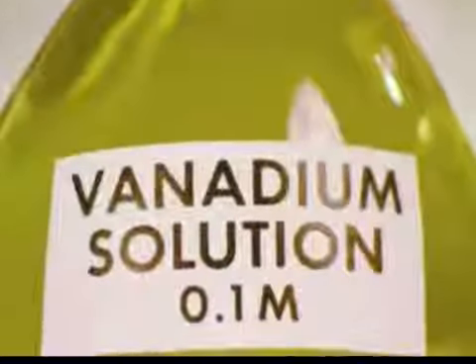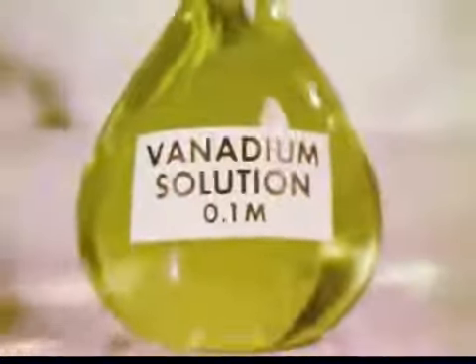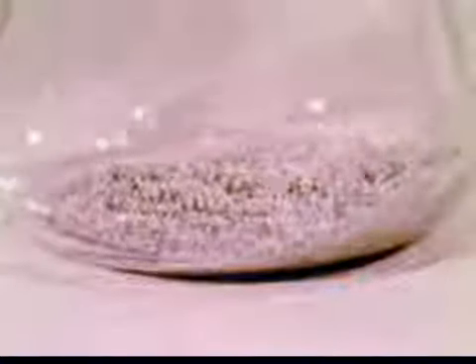Here is a standard solution of 5+ vanadium. Let's try to reduce it to other oxidation states. Zinc is a good reducing agent.